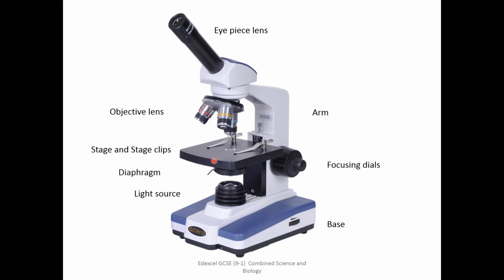The stage is where you would place your slide, and the stage clips would hold your slide in place. The diaphragm, which is under the stage, controls the amount of light passing through the image, which obviously is provided by the light source.